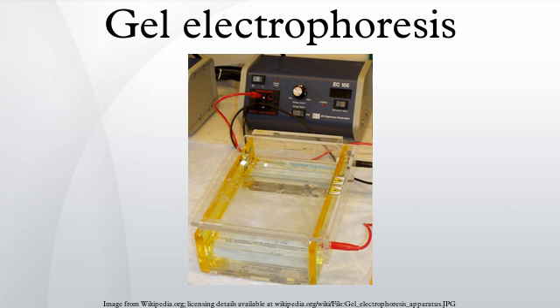It is currently most often used in the field of immunology and protein analysis, often used to separate different proteins or isoforms of the same protein into separate bands. These can be transferred onto a nitrocellulose or PVDF membrane to be probed with antibodies and corresponding markers, such as in a Western blot. Typically resolving gels are made in 6%, 8%, 10%, 12% or 15%.